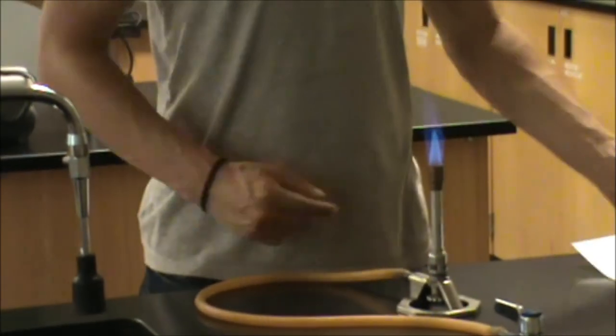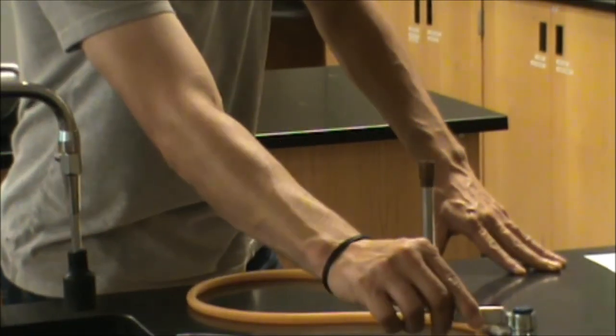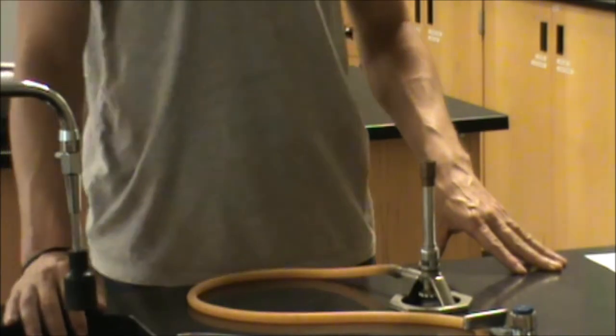When you're done with the Bunsen burner and you're ready to turn it off, simply turn the gas valve off and it will go out.